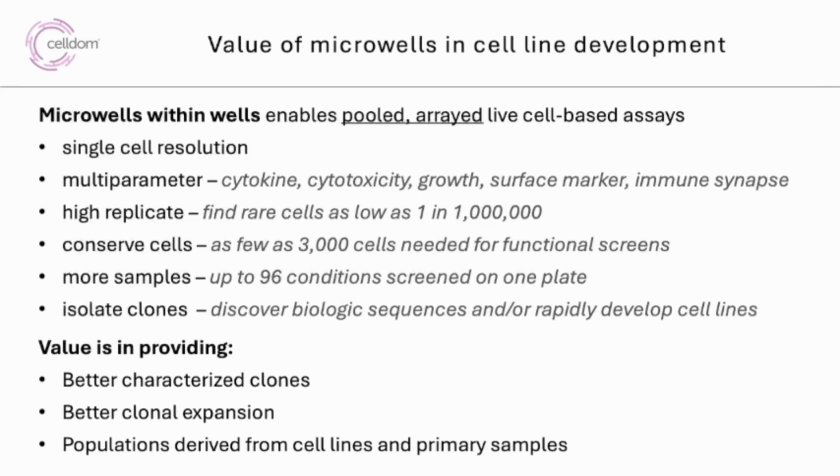It is pooled in the sense that each of the cells is exposed to the same media or perturbations as the other cells, so we can study the statistical properties of a population of cells, such as how cells respond to a small molecule drug or an activation reagent or other stimulant. However, it is arrayed in the sense that each cell remains in its own microwell through the duration of the experiment and can be retrieved individually for further expansion or analysis.